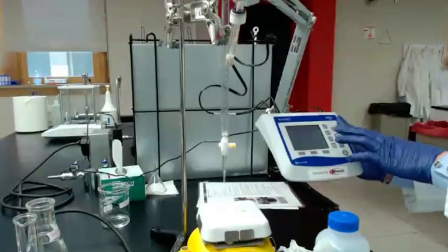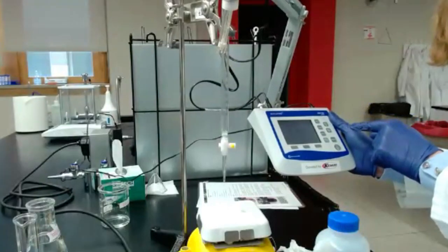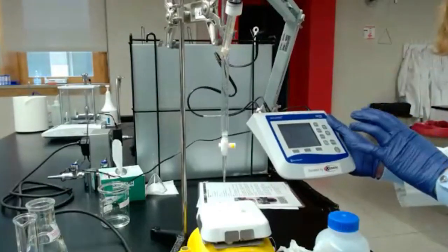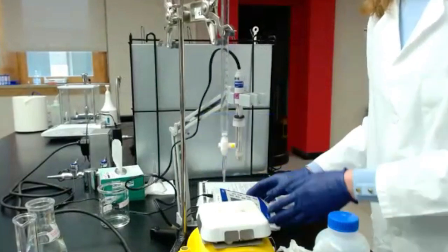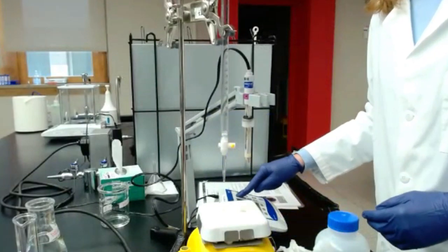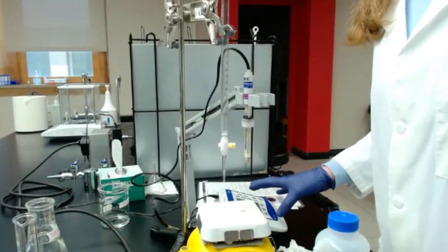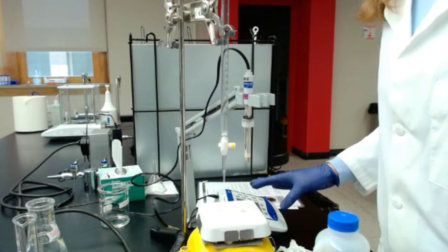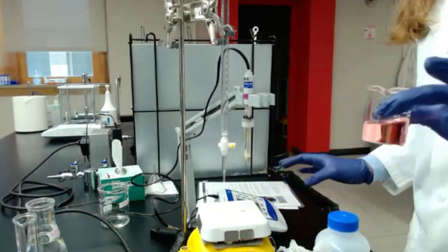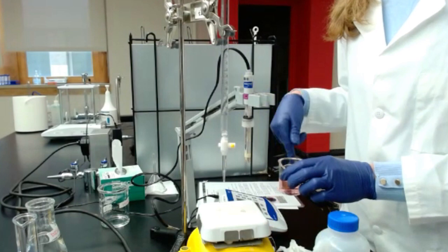That's the first thing we're going to do: pushing that button, either Cal or standardize, to start the calibration. Most pH meters are going to mention which buffer solution you should use first, because sometimes you should use the pH 4 first, and sometimes the pH 7.